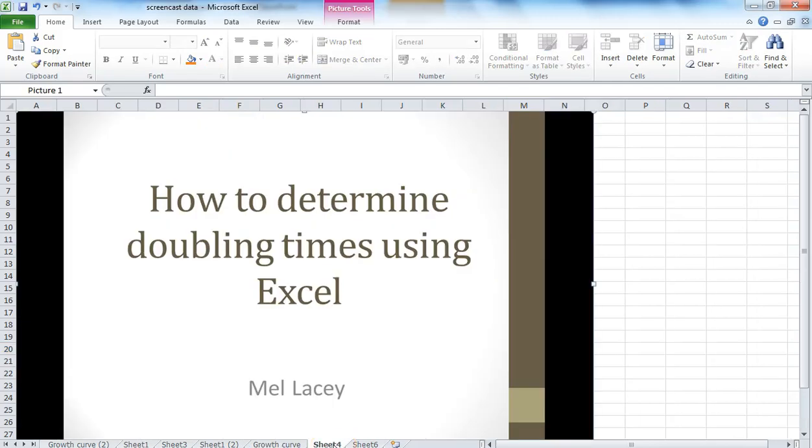Hello again, and this screencast is entitled How to Determine Doubling Times Using Excel. So this is a screencast specifically for the logarithmic lab report.